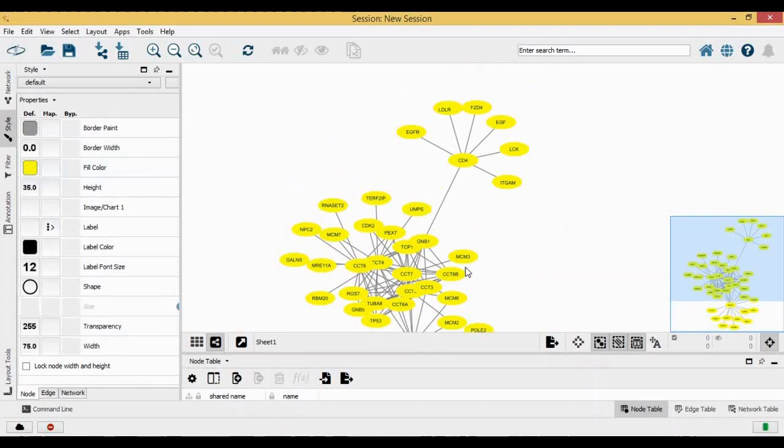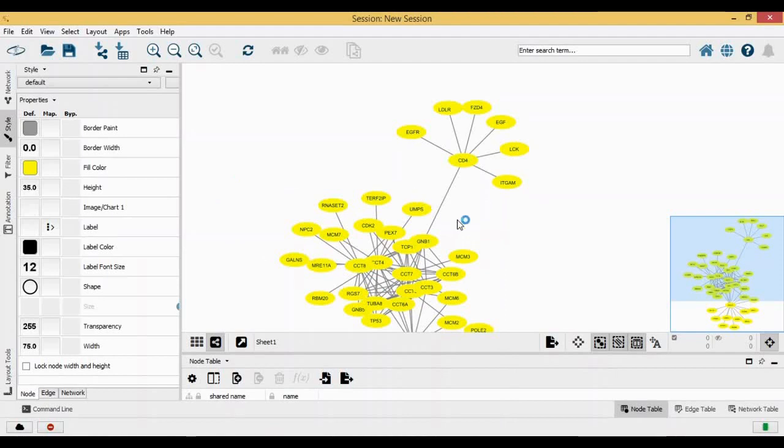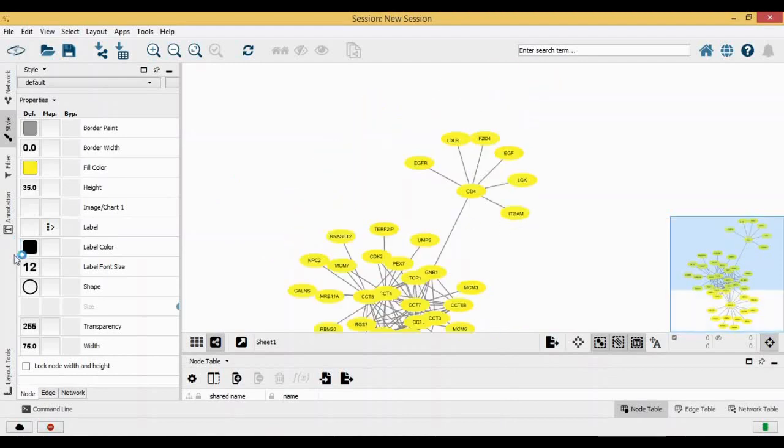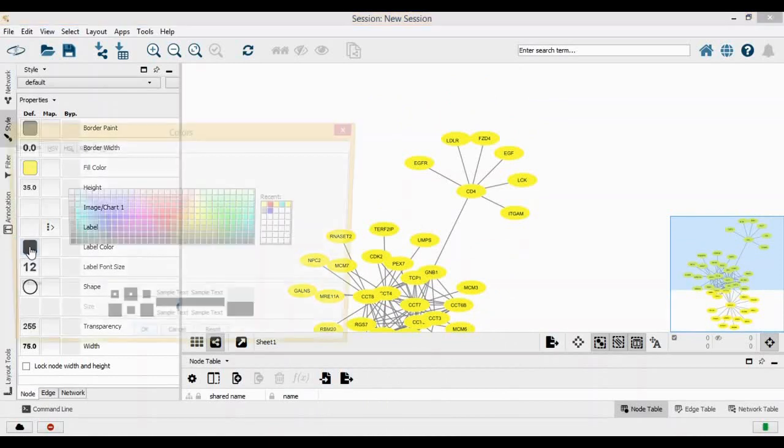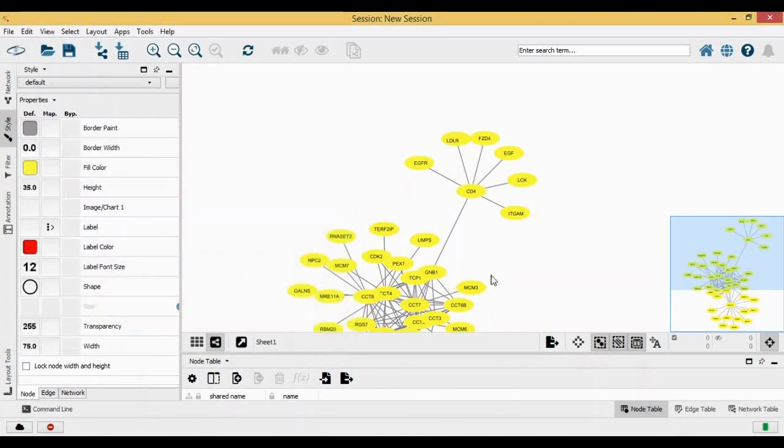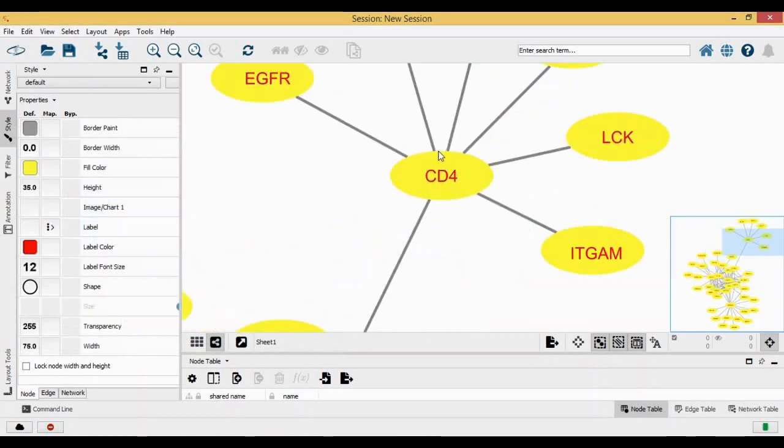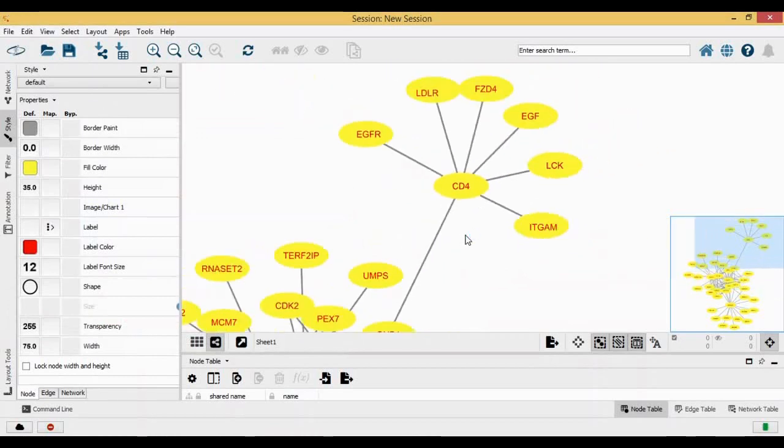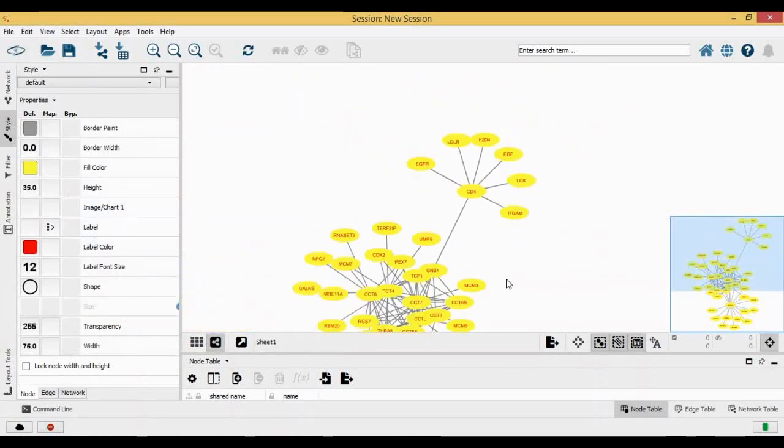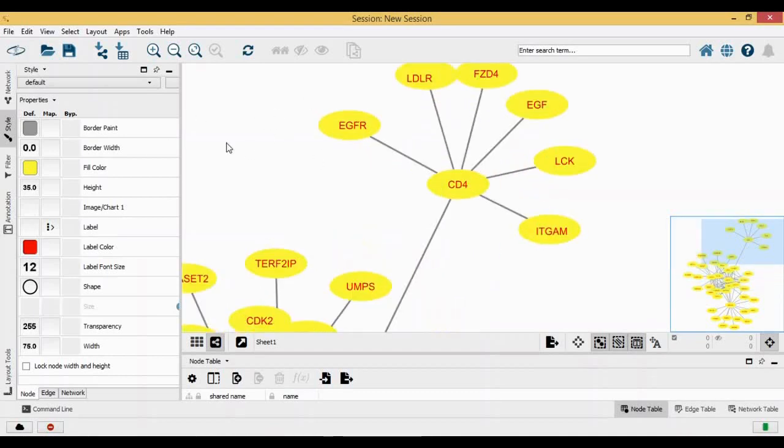This is how you can actually change the color of your network. You can change the shape of your network based on how you really want it. You can also change the color of your labels here if you want. Now it has changed into red.